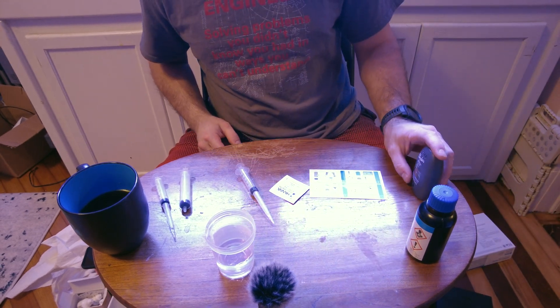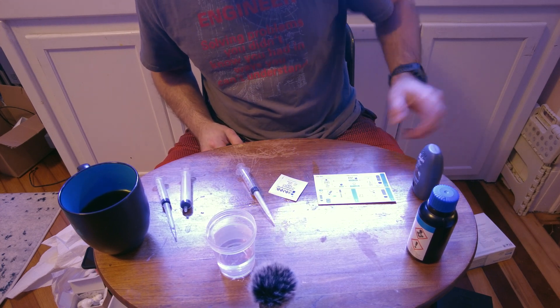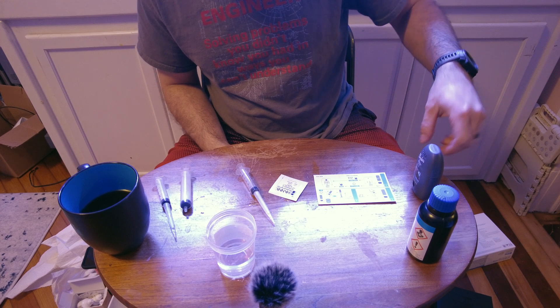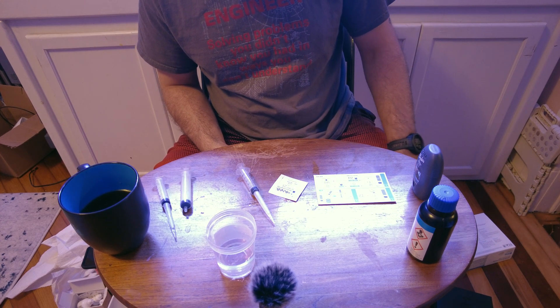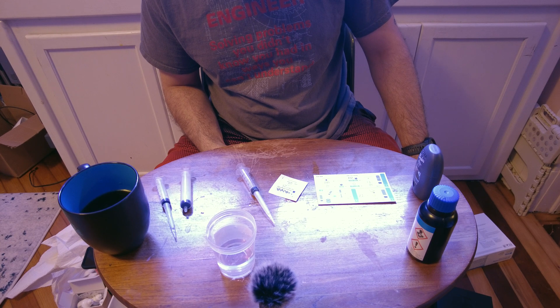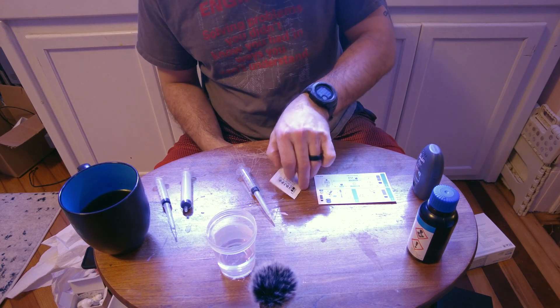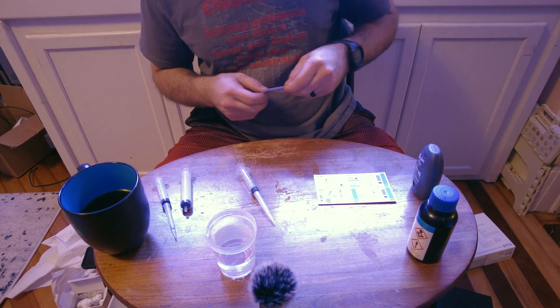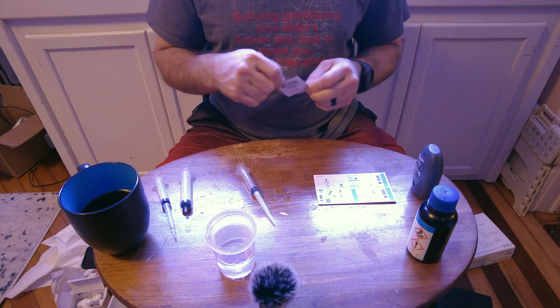Now that we've got the blank cuvette in there, we press the button — it does its zeroing, establishing a reference point. In the meantime I prep the powder reagent packet, and it's already done zeroing.